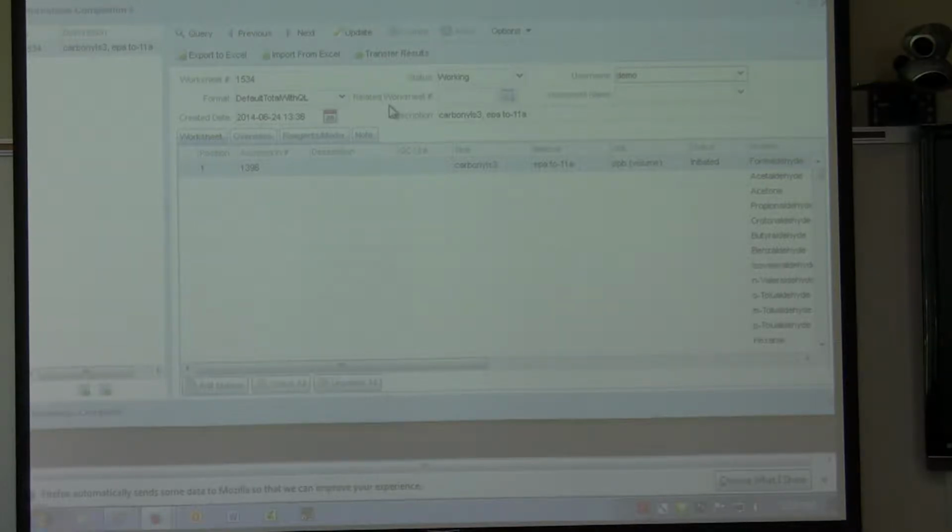What if you have two tests in there for the same sample number though? I'm pretty sure I made it smart enough to figure that out. They will have different analysis IDs, so it will figure it out, and you'll have to know which one to pick.